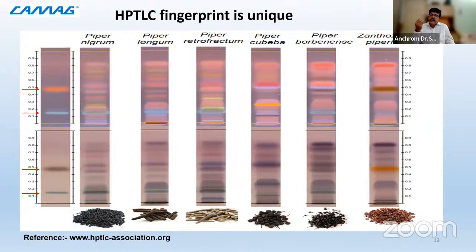But imagine in 100 kgs of sample, if I have 10% adulteration, it will give a lot of profit to the vendor. But when I'm preparing certain medicine out of it, similarly, when I'm having a batch that is 90% A and 10% is not, I can establish this, that yes, I am getting 10% less intensity, that is being proved with the scanner, and quantitatively I can say that this sample is not at 99% purity, but it is 90%. Then piperine will come, obviously, because pepper is there, but the pepper quantity is less.